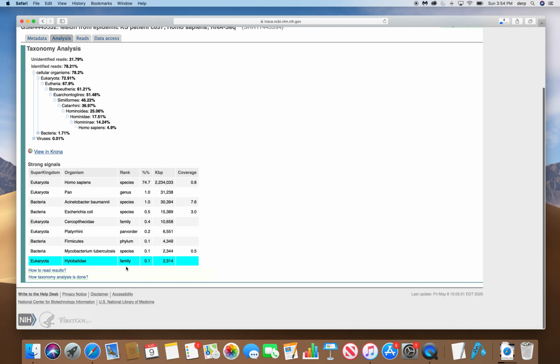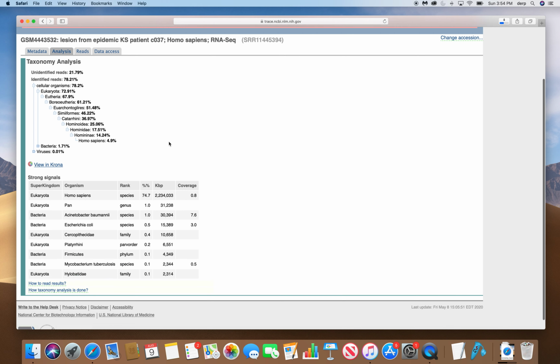And interestingly, very few of these reads actually map to any viral sequences, at least in this superficial analysis. It also seems like we don't have that many reads contaminated from bacteria, for example, or other human pathogens, and this is good to know.